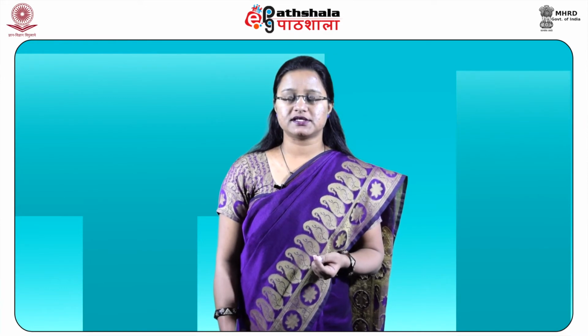So, this precipitated protein is then resuspended in an appropriate buffer containing a suitable pH. Now, remember, this buffer and suitable pH are the parameters which are decided by the kind of protein which is present. Its structure and its function should be retained in this particular buffer and pH. The resuspended solution is then dialyzed to remove high salt concentrations.